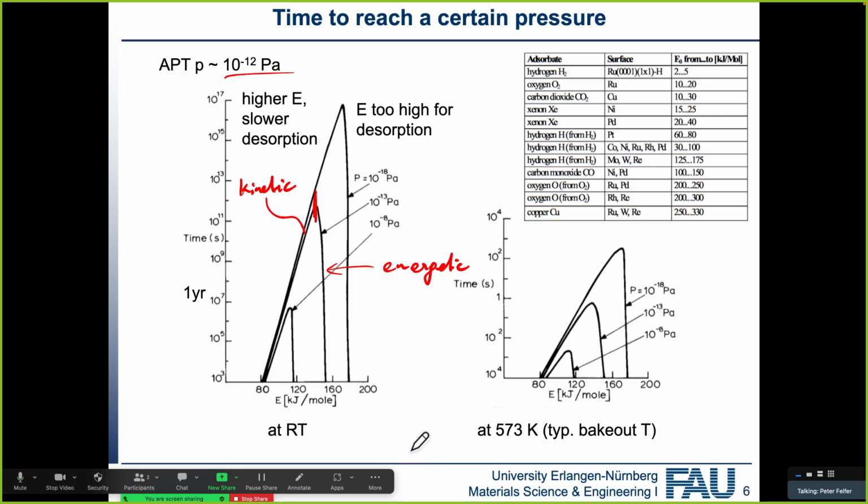But now if you're saying, okay, then I can just leave some oil in my ultra-high vacuum chamber and it will be fine. No, it won't, because you will always have some cosmic radiation. You will always have some processes by which these molecules decay into smaller fragments, and they will then start desorbing.